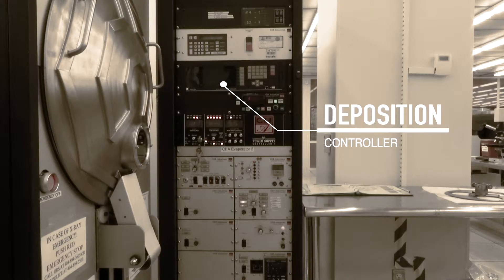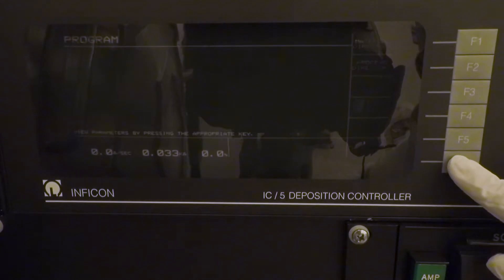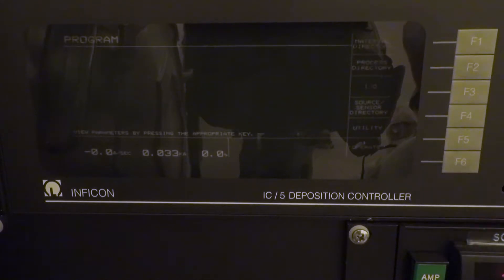The deposition controller allows the operator to set up, program, start, and stop the e-beam system.